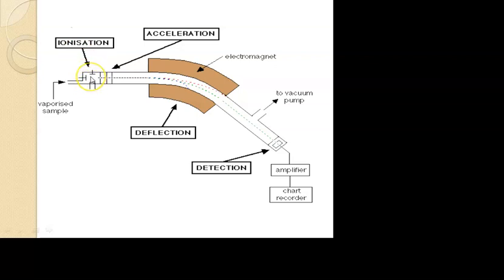The negative ions or electrons are going to be trapped, and the positive ions are moved ahead. This process of moving ahead is carried out by the ion repeller, which is present in the ionization chamber. Then acceleration of ions takes place, and while accelerating, this whole tube has an electromagnetic region. The ions are bifurcated according to their masses.